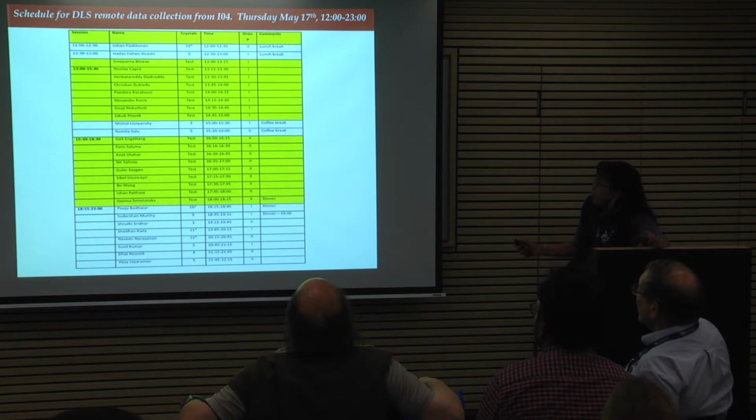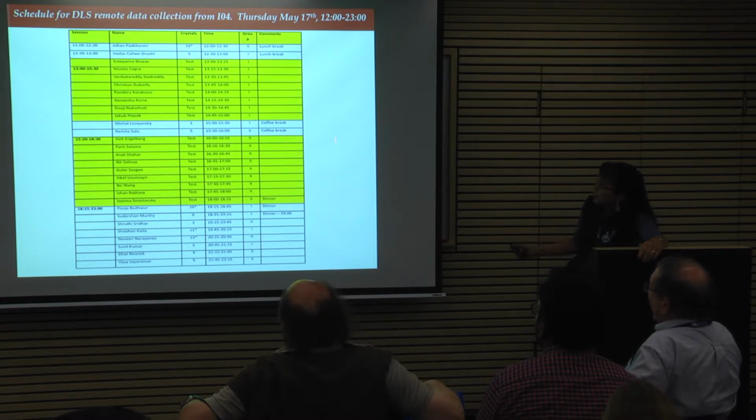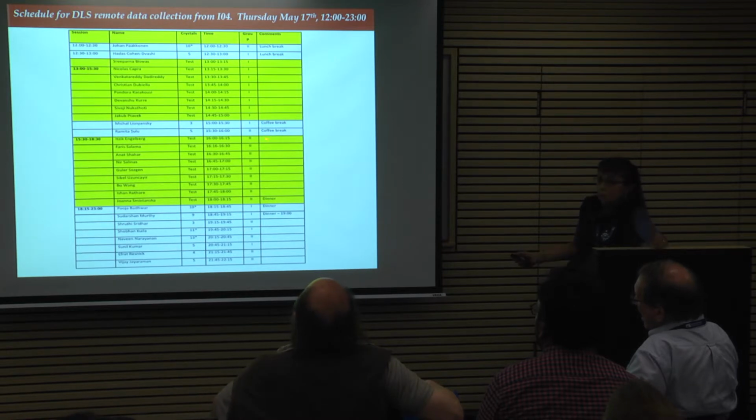For DLS, the same idea. When one group is collecting data, even if only one person is collecting, the whole group is together with them in the same room. The other group are still going to process data, either from ESRF or practice DIALS and CCP4, and so on and so forth.